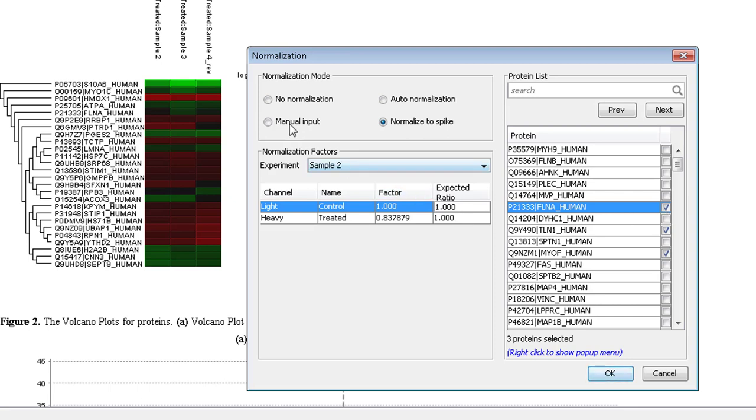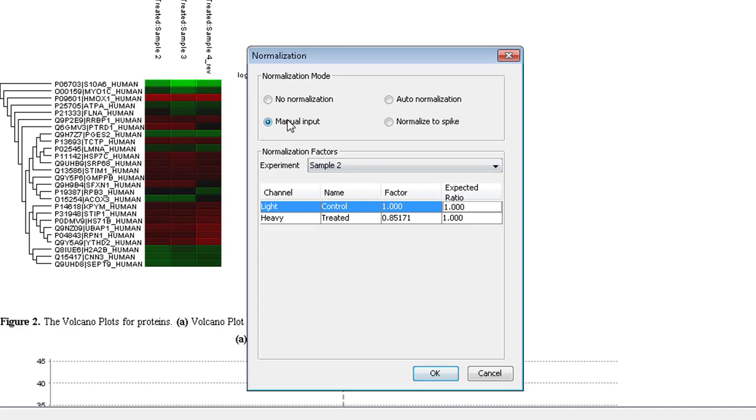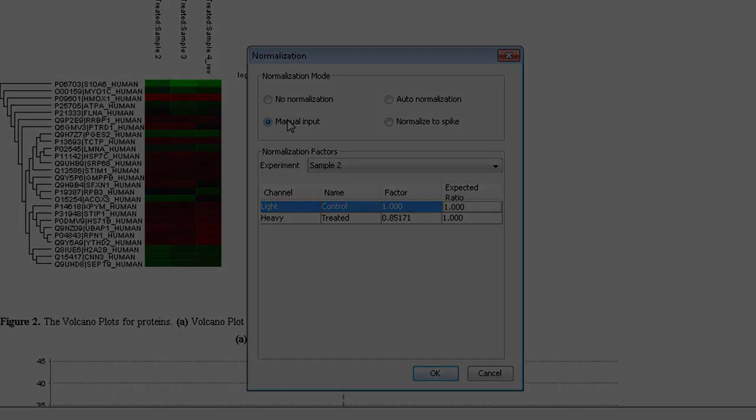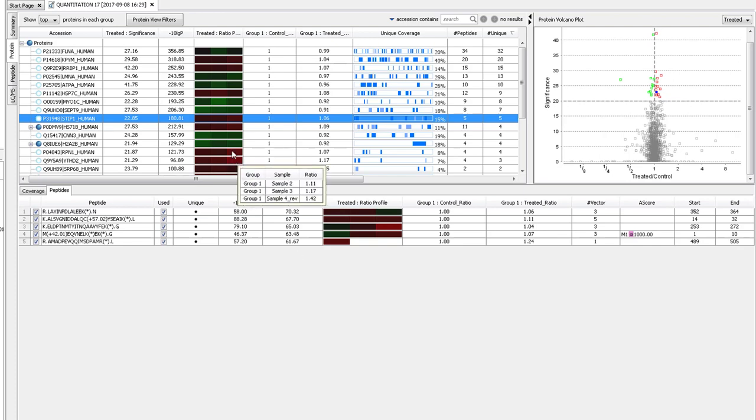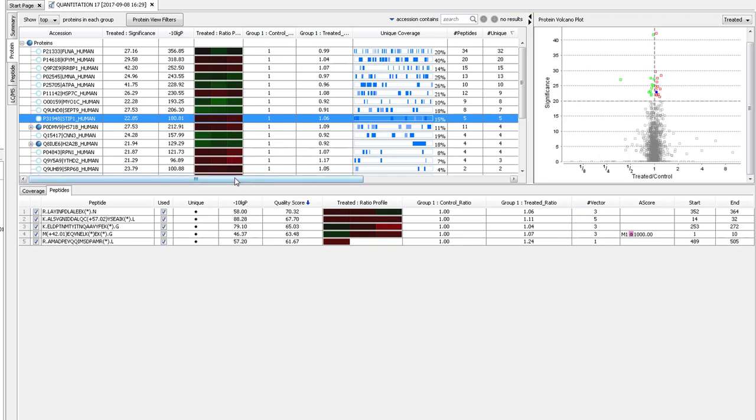The manual normalization option allows you to give an expected ratio if you don't expect that the ratio between the samples will be 1 to 1. Here in the protein table, you can see the quantification details of any of the proteins that pass the filters on the summary page. The heat map displays the ratio of each replicate's treated sample relative to the control.